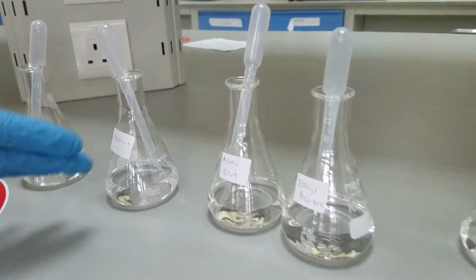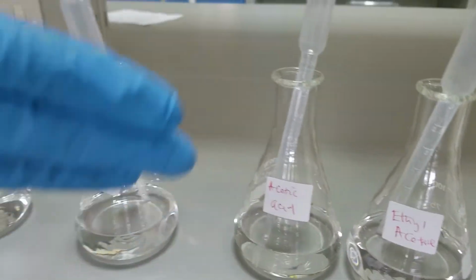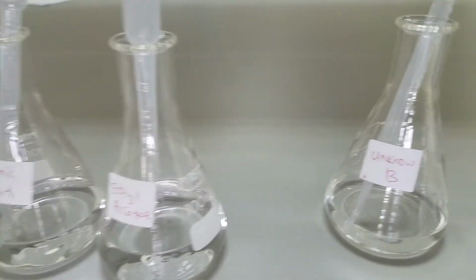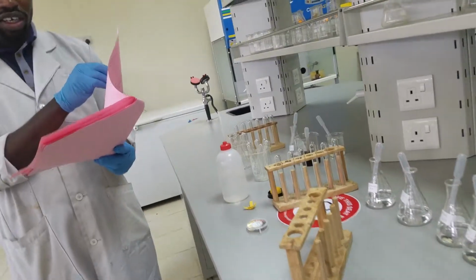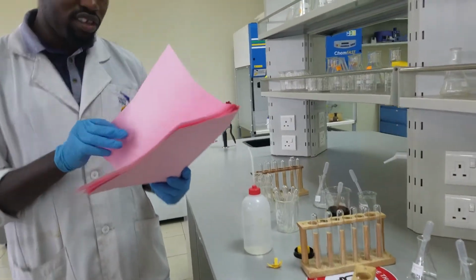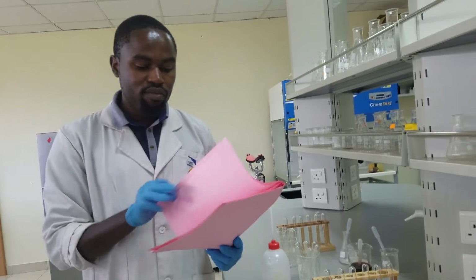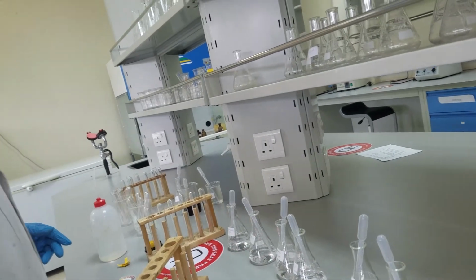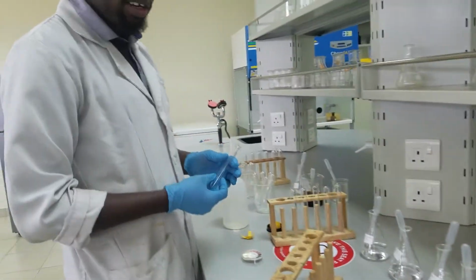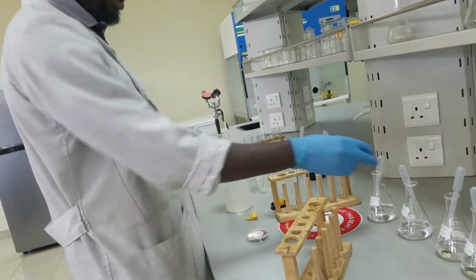So we have acetone, formaldehyde, acetic acid, and ethyl acetate. So we have a total of 4 tests that we are going to do today: solubility, acidity, iodoform test, and bicarbonate test. So I'll start with the first one, that is solubility.